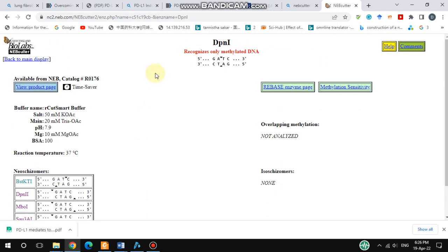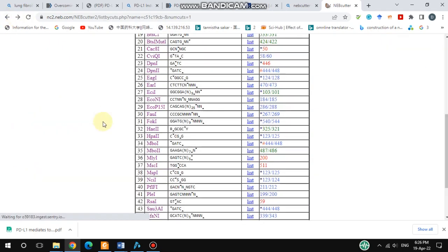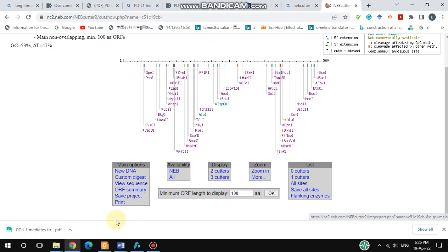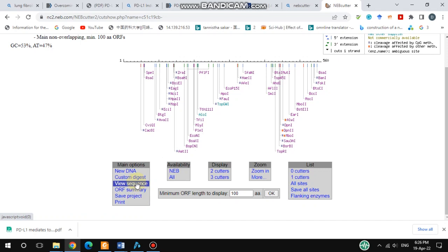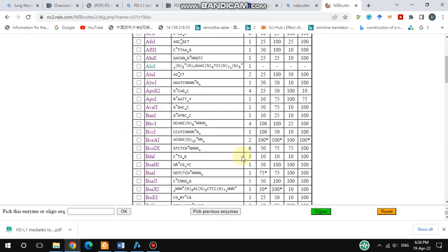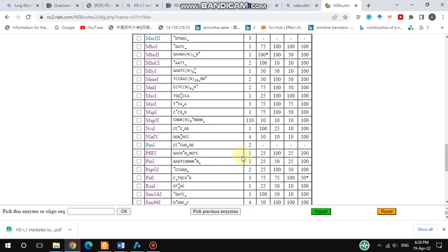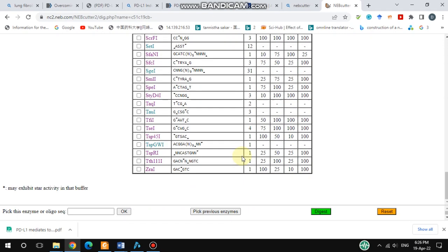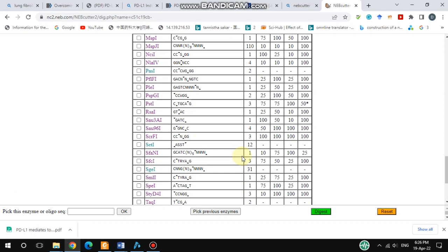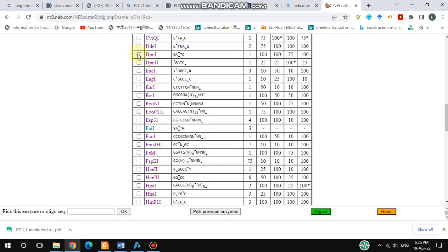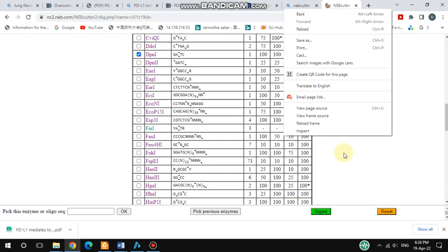If you go back to the main display and choose Custom Digest, you will get a dialog box with all the enzymes listed. Here you can also choose gel information such as gel percentage and marker. Select DPN1 and then hit the Digest button.